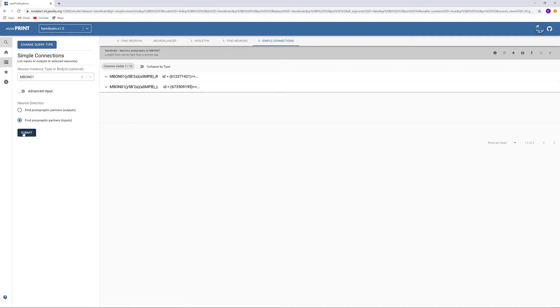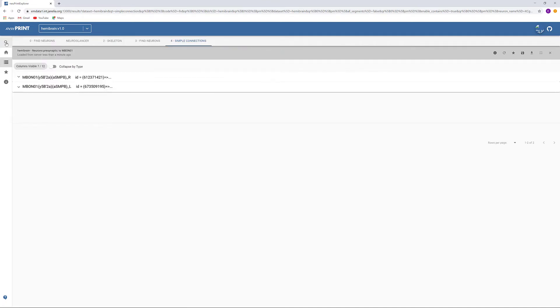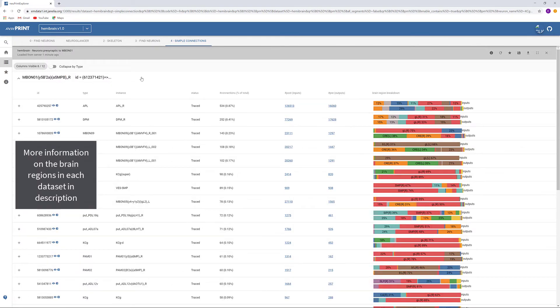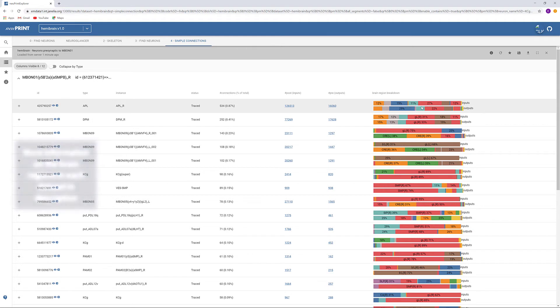We see two MBON01s because one is in the left hemisphere and the other is in the right hemisphere. We are interested in the right neuron. We know that most Gamma KCs will be presynaptic in the calyx or ventral accessory calyx and postsynaptic in the gamma lobe, so we can cross-check this information with what we see in the brain region breakdown.